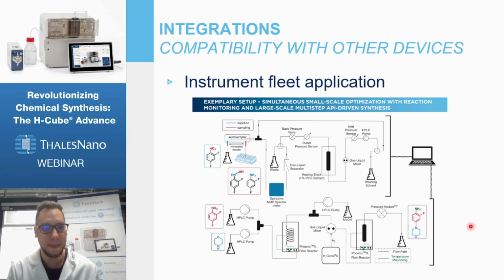So this is quite a convenient example of a reactor fleet where 2 parallel things are happening, and you can use one result to much more quickly optimize the large-scale synthesis.